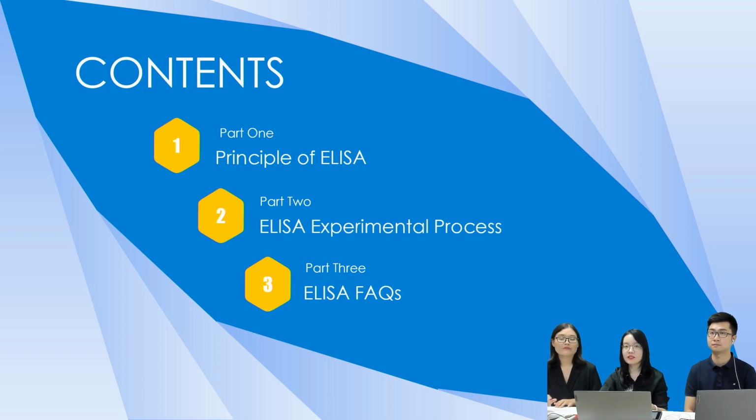And our topics today are divided into 3 parts: the principle of ELISA, the operation process as well as the data analysis, and the ELISA frequently asked questions.